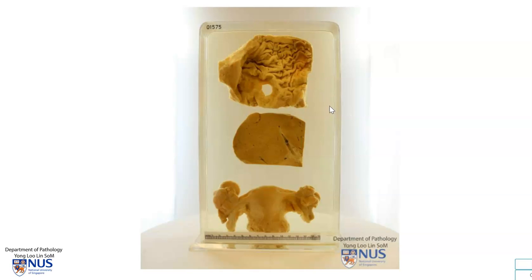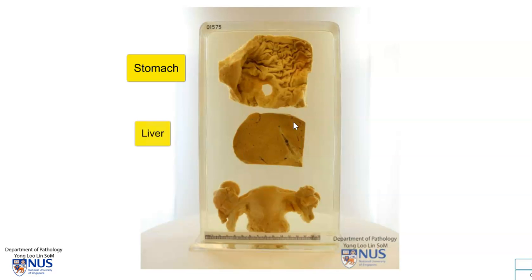Hello, this is a pathology specimen which comprises three different organs. We have here the stomach with the gastric rugae, there is a slice of liver here, and this is the uterus with bilateral adnexal structures. Let's take a look one by one, and let's first have a look at the stomach.